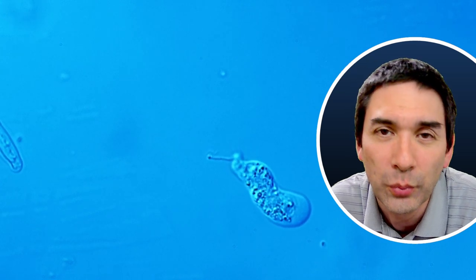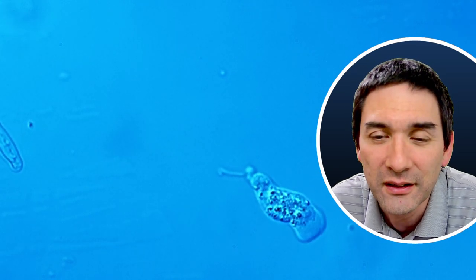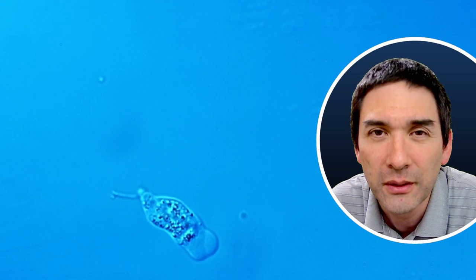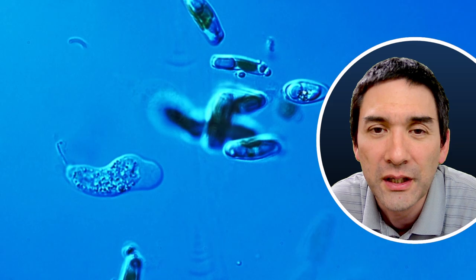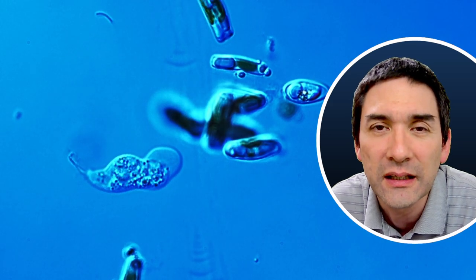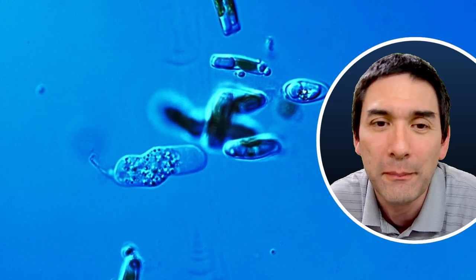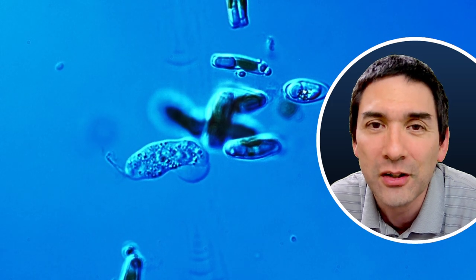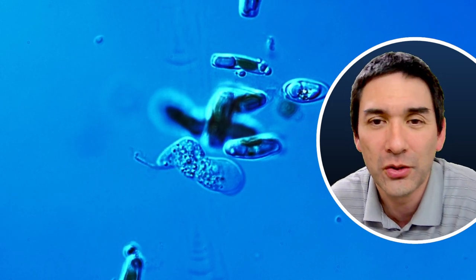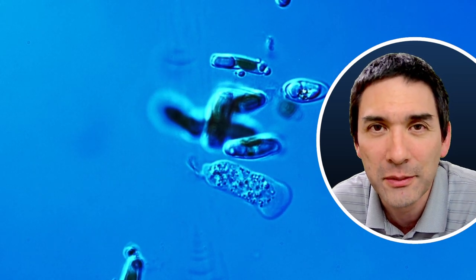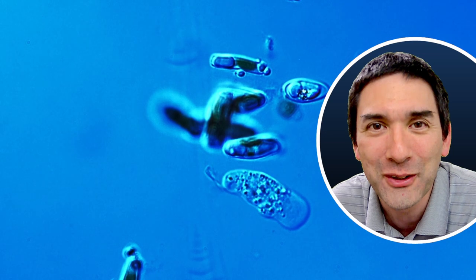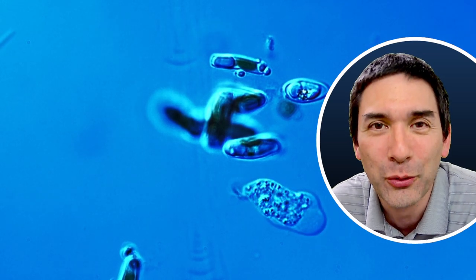But this one was significantly smaller than the one that I showed you previously. And you can also see that it's not quite as colorful inside because of the food that it's eaten. And here you can see again, a little bit of a size comparison between the amoeba and the diatoms that I just showed you before. So this is also quite an interesting thing here. Kind of reminds me that I should wash and clean my coffee machine more frequently.